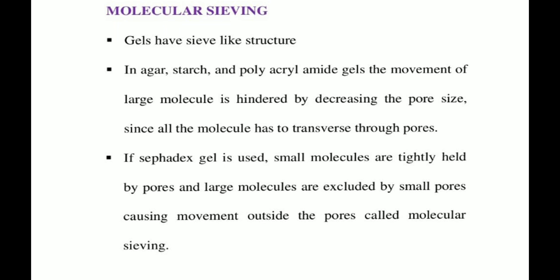The movement of large molecules is hindered by decreasing the pore size, since all the molecules have to transfer through those pores. Okay, so if a Sephadex gel is used, small molecules are tightly held by pores and large molecules are excluded by small pores, causing movement outside the pores, called molecular sieving. म्हणजे सपोज आपण एखादं स्मॉल साईज किंवा स्मॉल पोअर साईज असलेलं जेल यूज केलं, ठीक आहे.